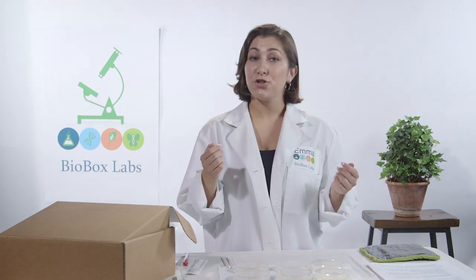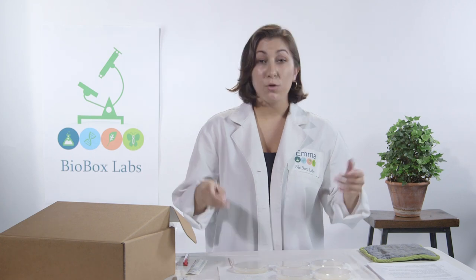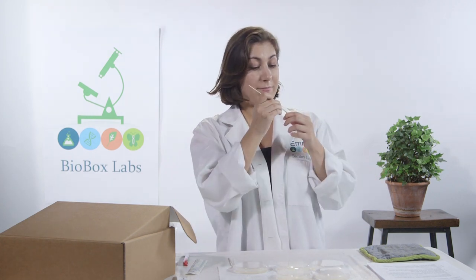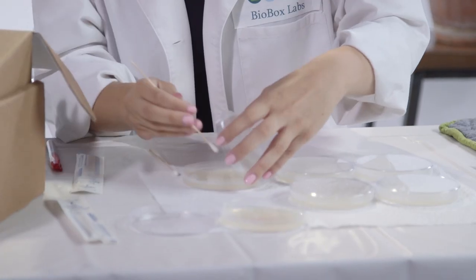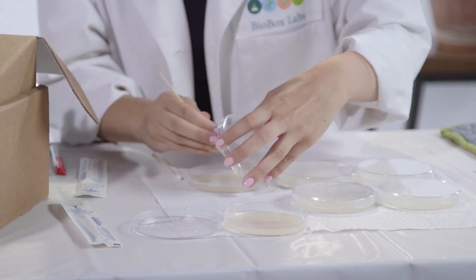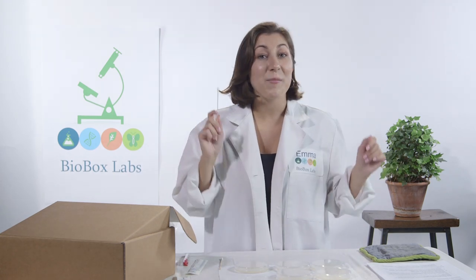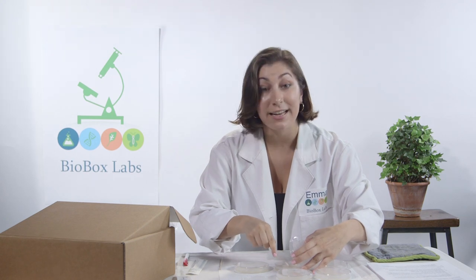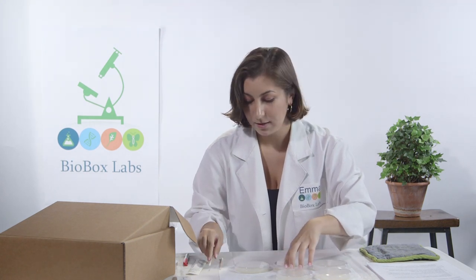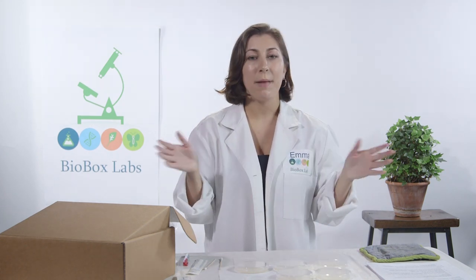If you want to collect the germs in the air, open the petri dish and let it sit for about 30 minutes. If you want to use the germs from your fingernails, get some out — don't open it all the way, otherwise the air will get in — and streak it in zigzags. If you want to use the germs from your dog's water bowl, streak it in zigzags just like the other one. Now let these sit for about three to four days in a warm place, and you'll be amazed at what you see.